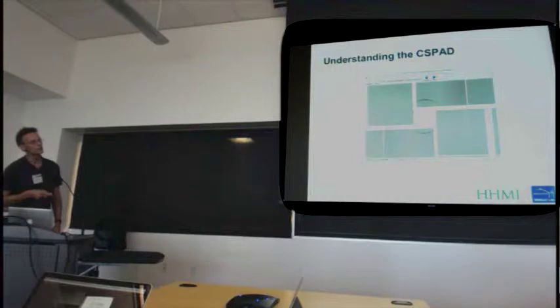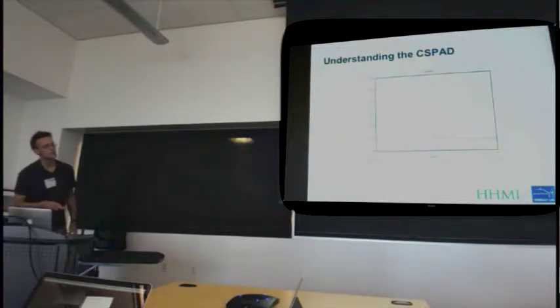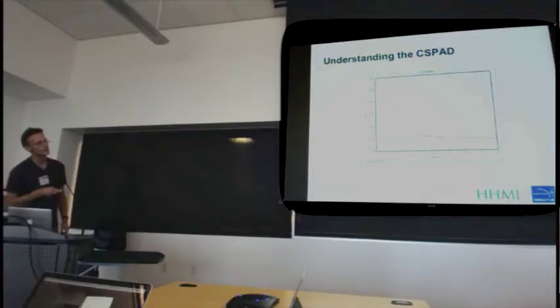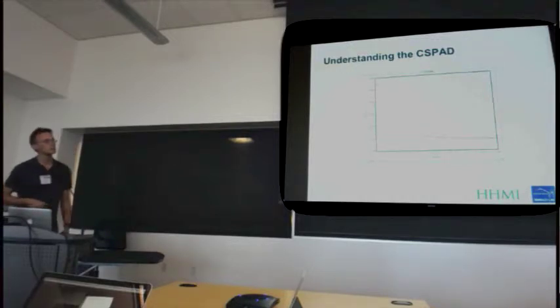But also being computationally oriented people, and seeing this, we figured that we could write something that automatically does this. Given an image like this, it should be able to correct things, and it kind of did, in a way. There was an iterative procedure that was trying to look for these rings, and then trying to arrange the tiles such that these rings were concentric. What's shown here is the error in that function as a function of the iteration, and we can see that it converged. The problem was that it converged to something that was only vaguely related to what we would have expected.